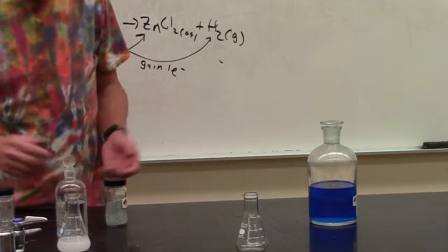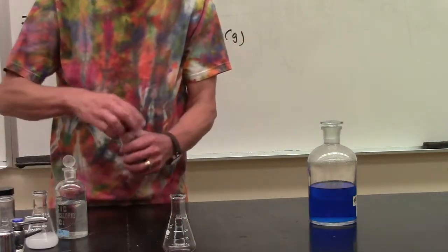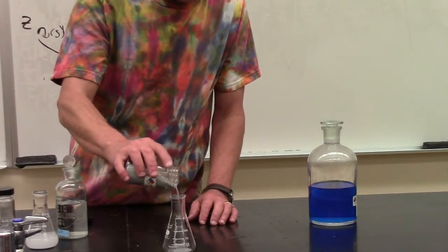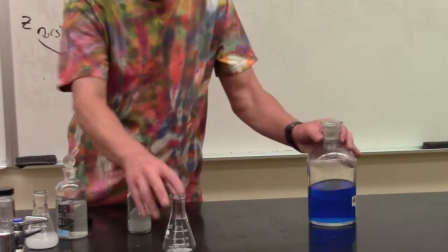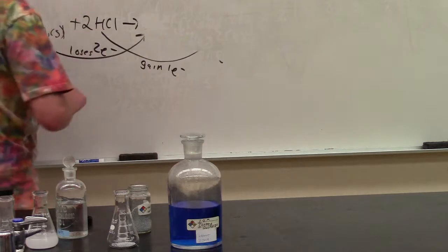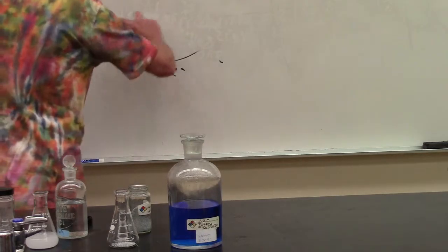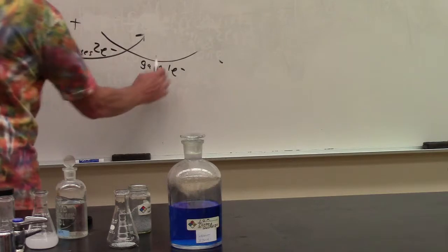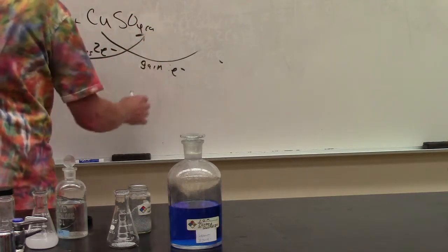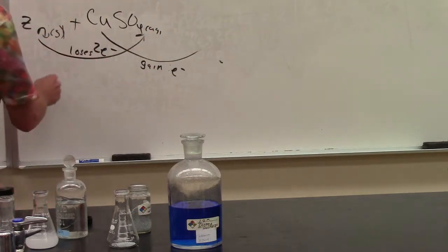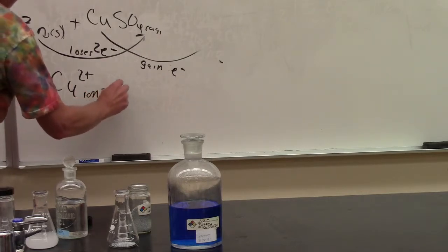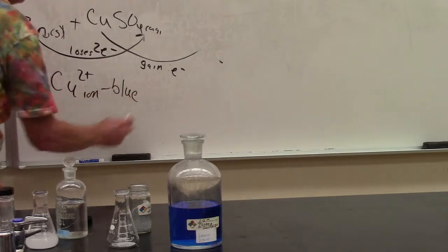Last but not least, we can actually have other reactions occur. So again, I am going to take some zinc solid. And in this case, I'm going to add copper sulfate. Now, copper sulfate is very blue. And in copper sulfate, we have the copper 2+ ion, which causes the blue color.